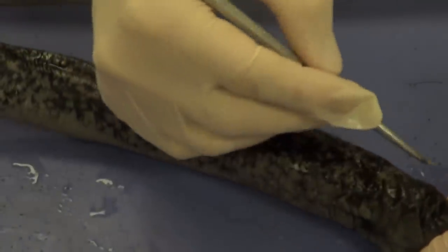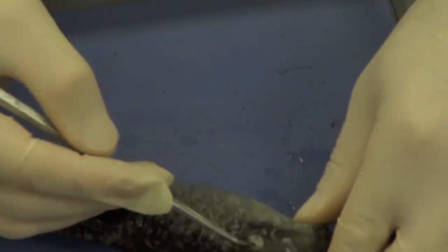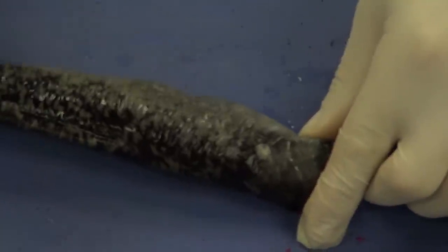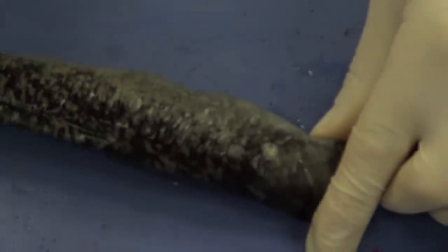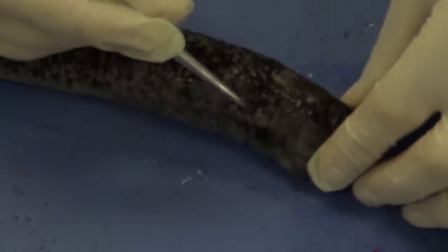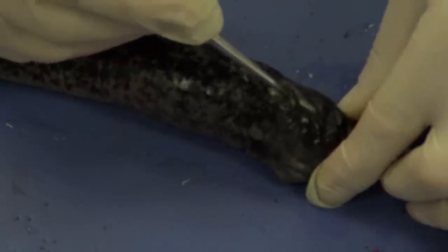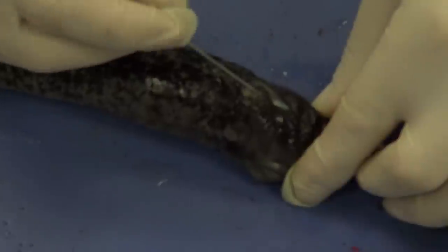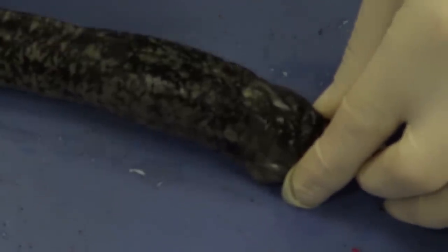Let's go ahead and start with the headward region. We're going to start by looking at these two opacities — here's one right here, and here's another right there. Those are the eyes. The reason they're not transparent is because the preservative denatures the tissues and makes the lens cloudy. Right between the two eyes, going just a bit anterior, there is a tiny hole — that is the external nostril. That external nostril leads to an olfactory bulb, which is used to process the sense of smell. That's how the lamprey actually smells.